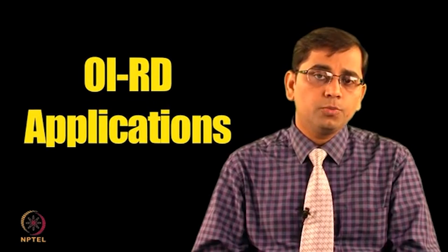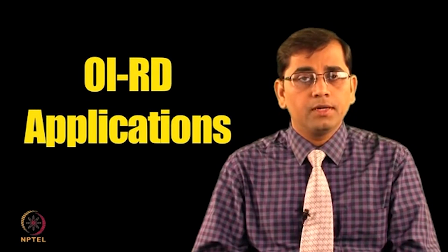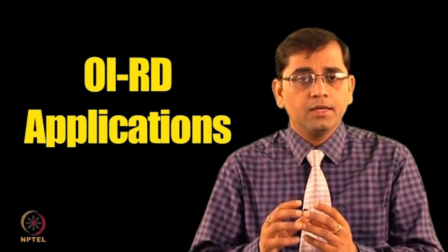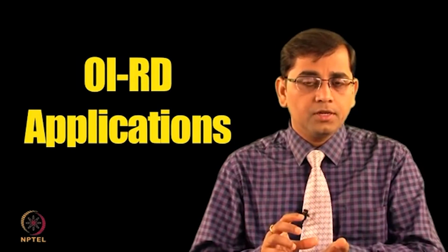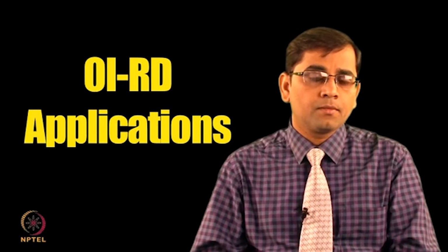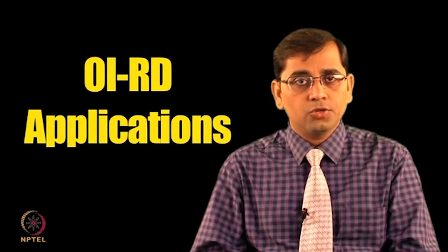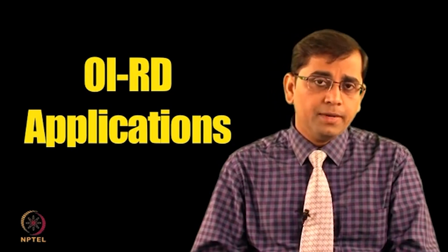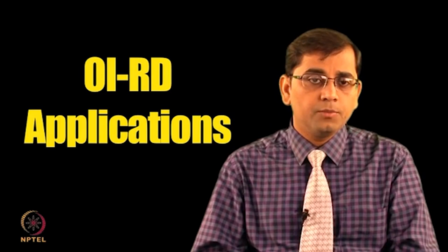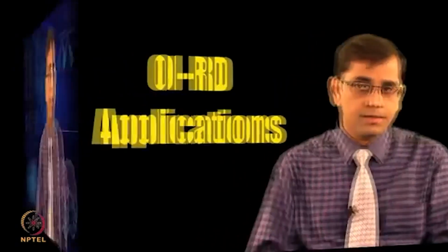The OIRD microscope has been applied for real-time monitoring of antigen-antibody interactions, nucleic acid hybridization and protein small molecule binding reactions. There are various applications of OIRD which makes it a good choice for label-free detection of proteins on microarrays.